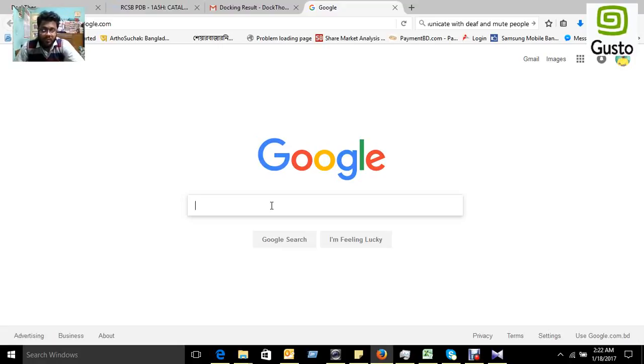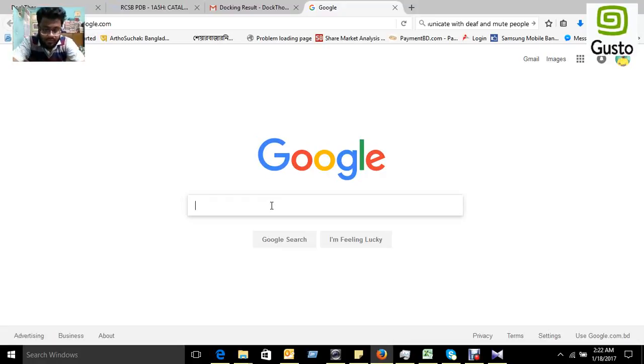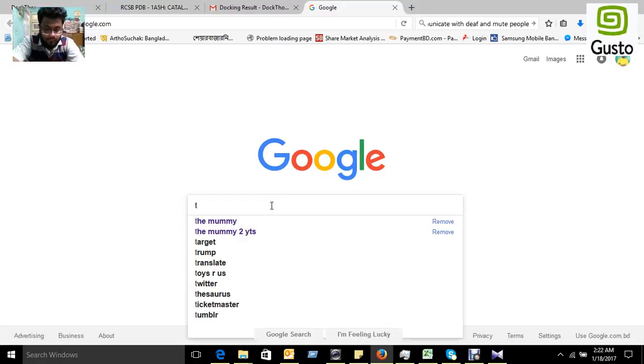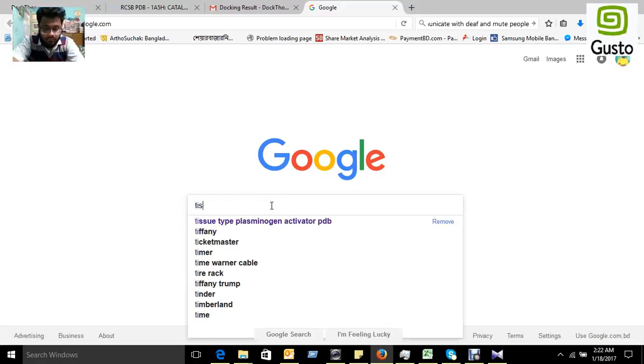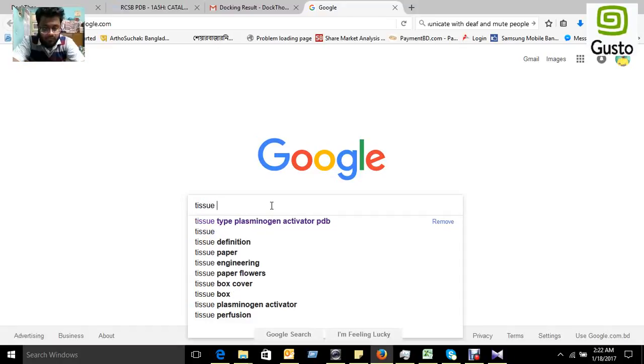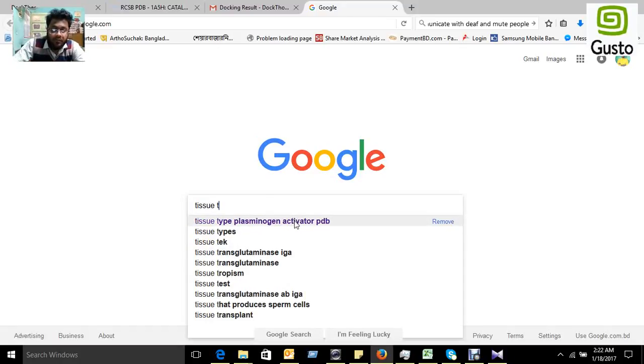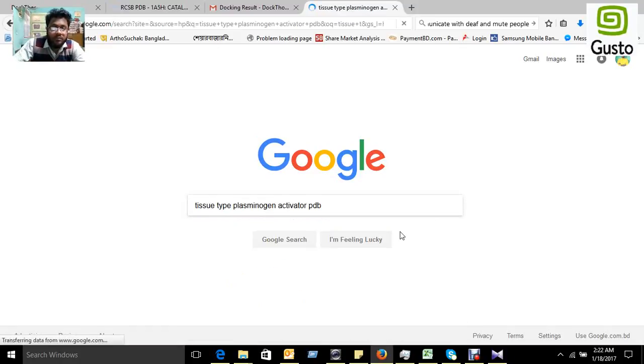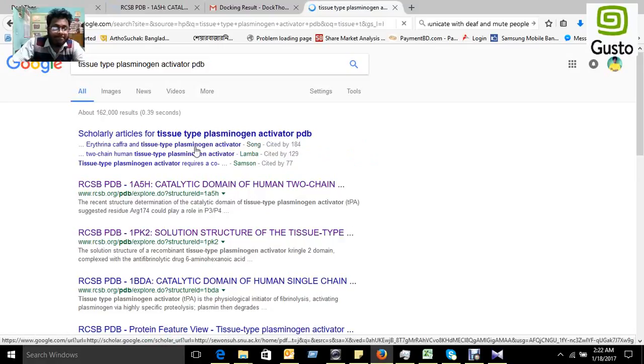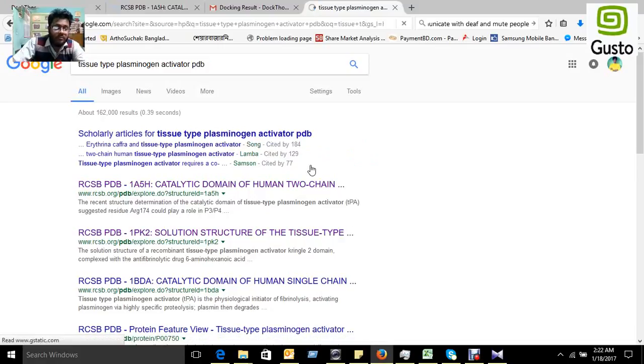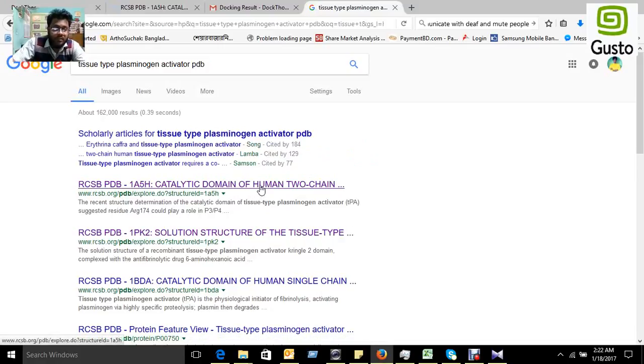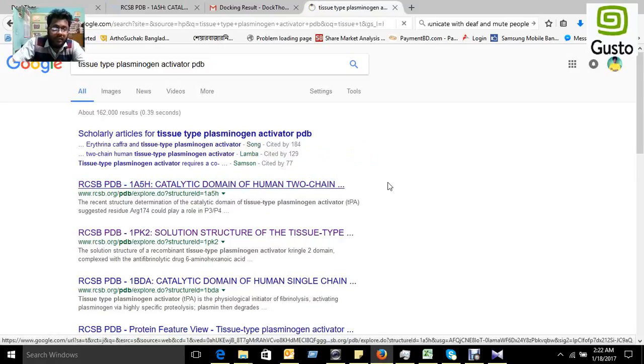We found tissue plasminogen activator. This is the PDB ID.